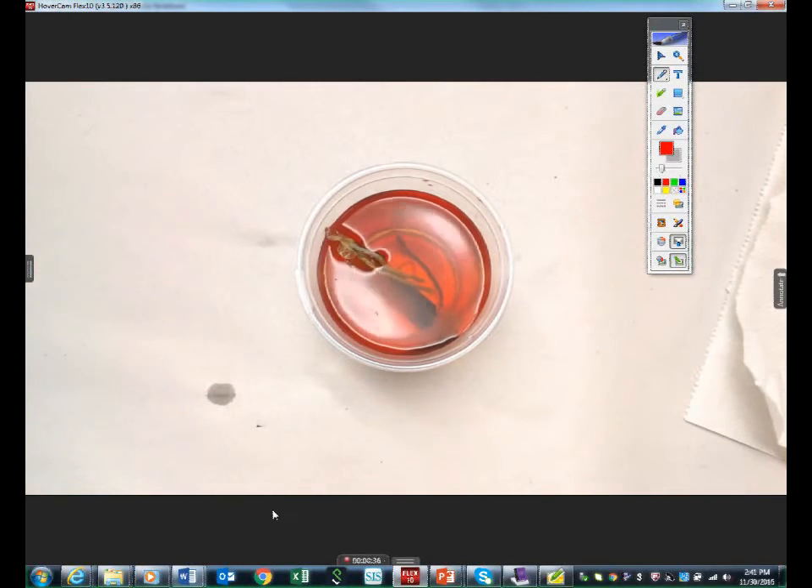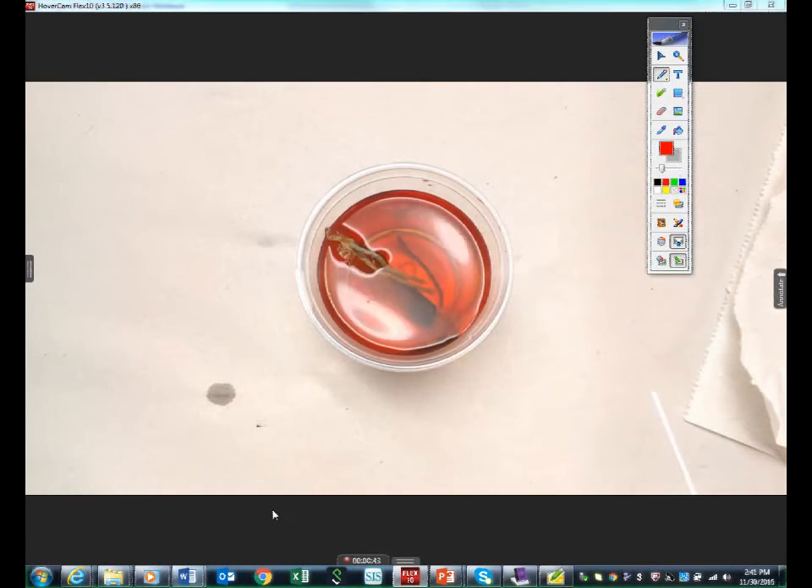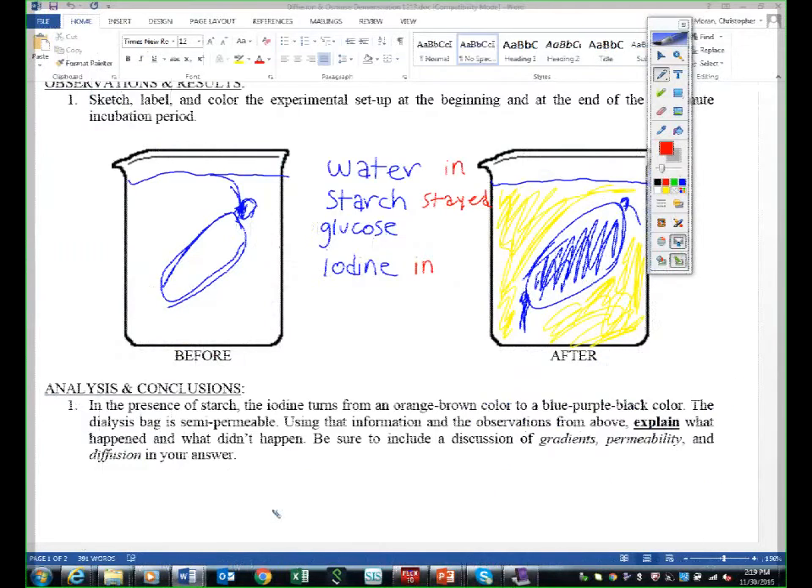The last thing we have to do is test to see: did glucose leave the bag? Take a look. We wrote water in, starch stayed, iodine in. We're going to test and see if glucose — did glucose leave the bag?